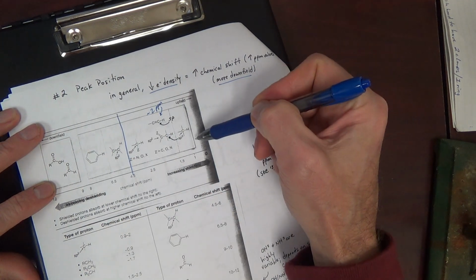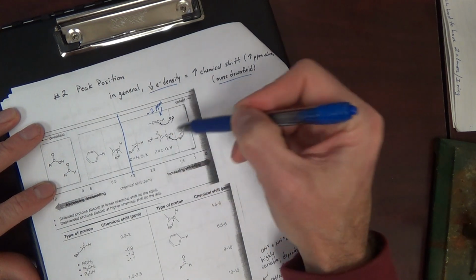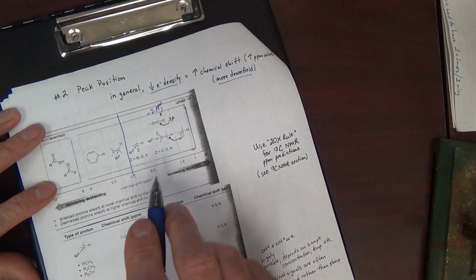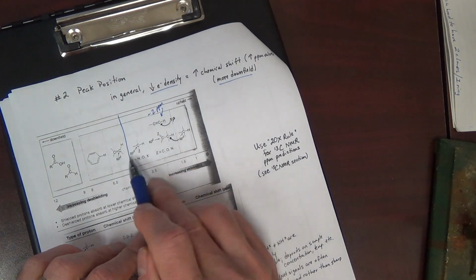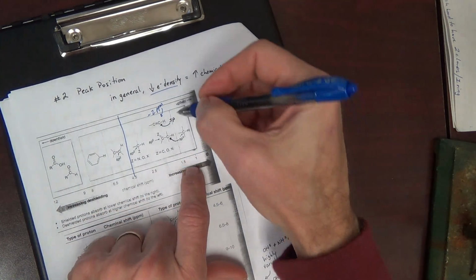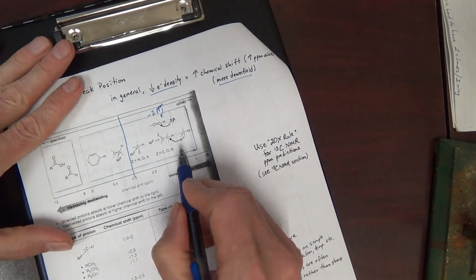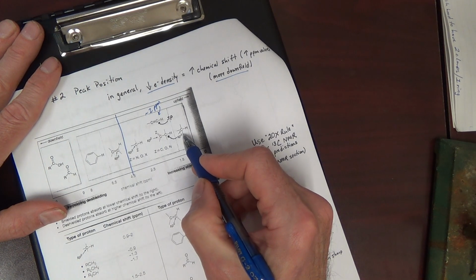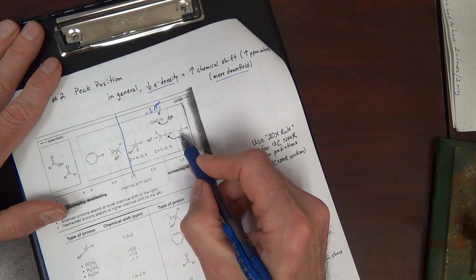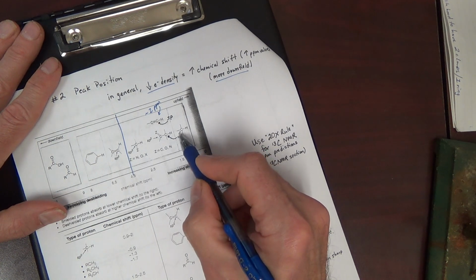Now, it can be less than 1, maybe 0.5 or 0.8, somewhere in this range. But let's distinguish between these types. A standard alkane, just like butane or hexane, is going to be like 1 ppm, 1.5 ppm.